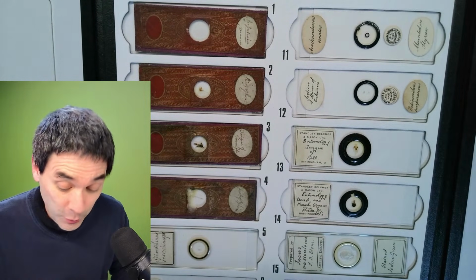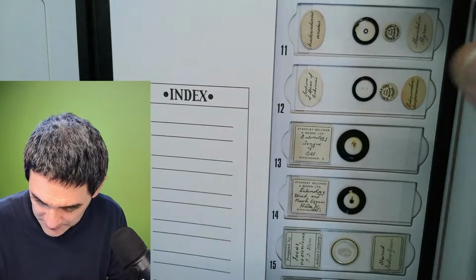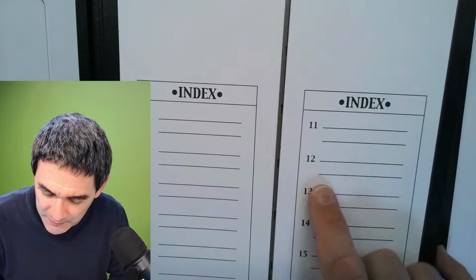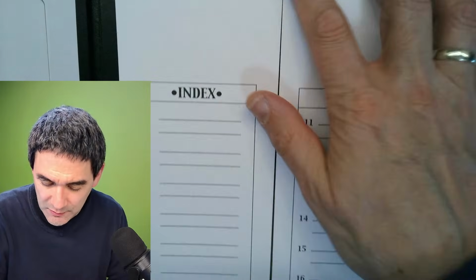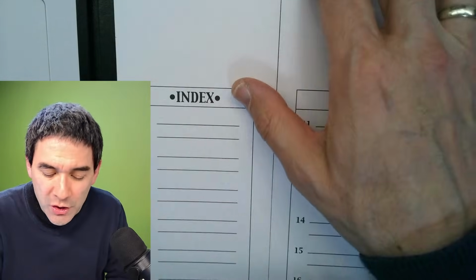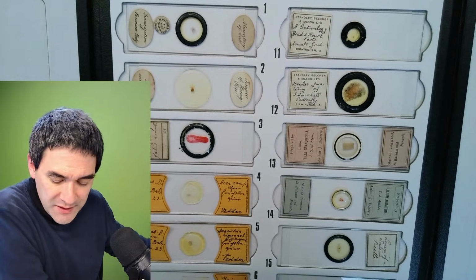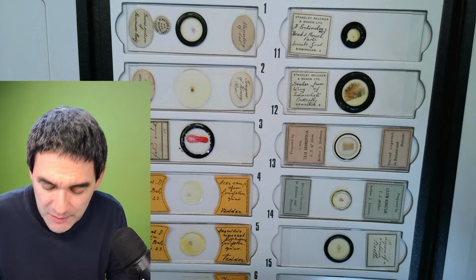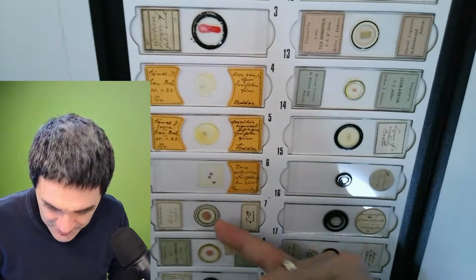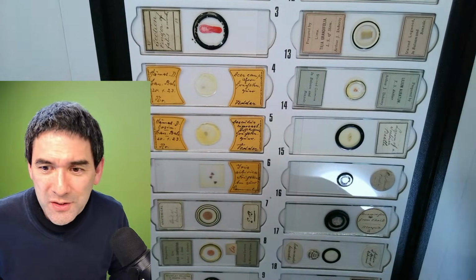Honestly, I think they're top quality, and some of them are really 100 years old. We can also have a look at those. You might wonder why I put them in a folder like this. The reason is that old slides especially should ideally be stored horizontally, because otherwise there might be too much stress on the mounting medium. One of the other things I like about those slides is, look at the ring. They actually use color patterns. They made it quite nice.